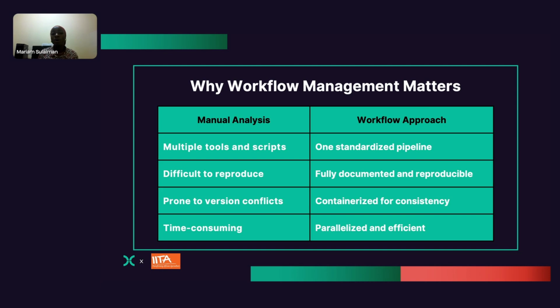Manual analyses are also very prone to version conflicts, but workflows are containerized for consistency. And manual analyses are very time consuming too, but with workflows, you have a parallelized and efficient analysis. So as someone who was just starting out, this structure of the workflow was a lifesaver for me.